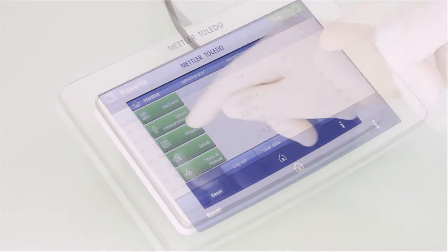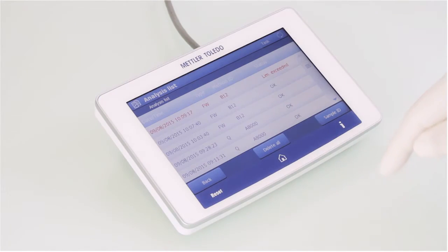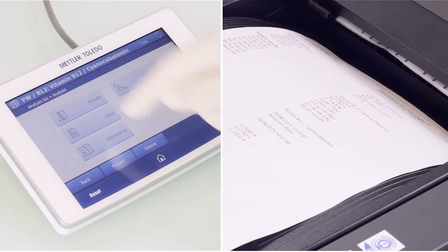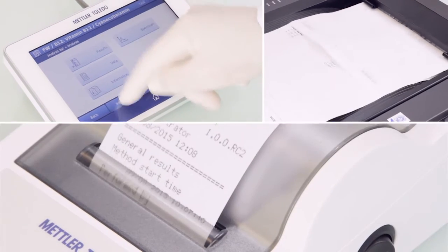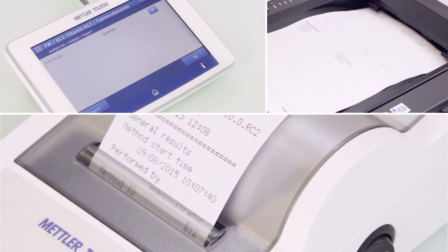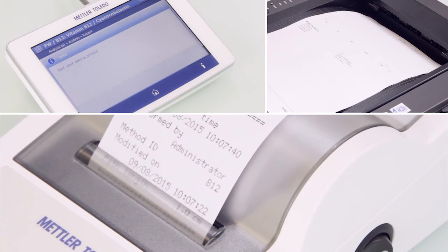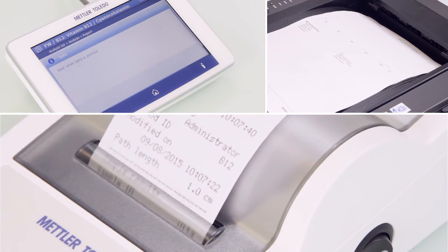A report is automatically generated and can be sent to a network printer or to a USB device. Results can then be printed or exported to a USB drive.